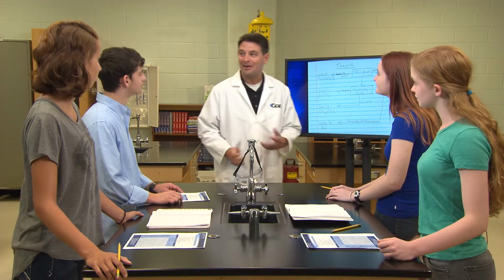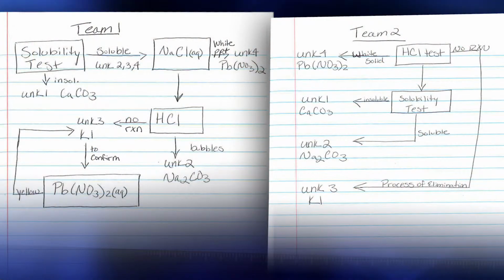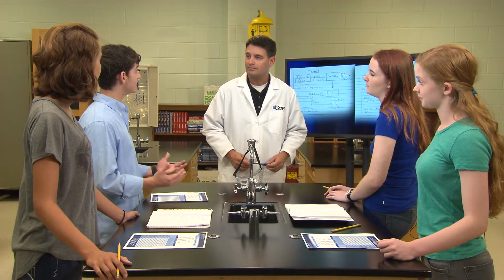Great work, all of you. What you've done is you've demonstrated that there's more than one path to the correct answer. So can you guys think of a job in which this kind of chemical testing might be used to identify unknowns? I was watching a movie last week and they showed a lab with an FBI technician testing some drugs with a colored test kit. Different colors meant different drugs.